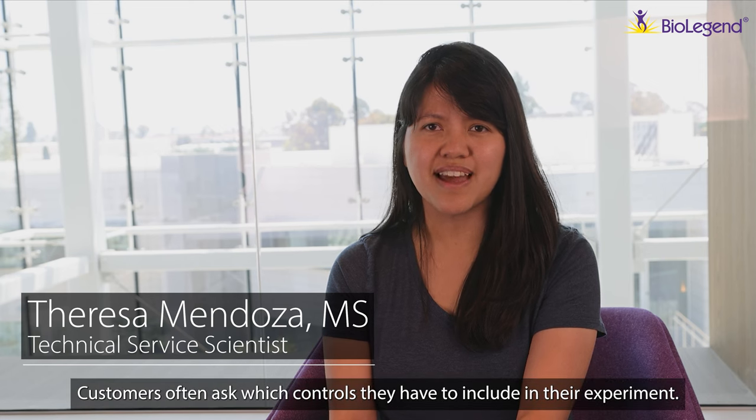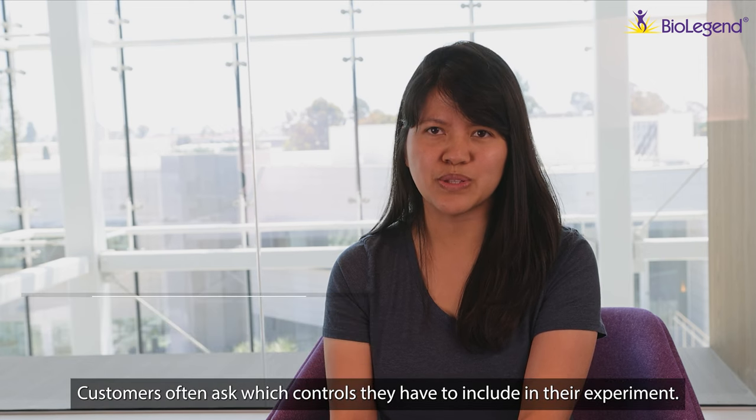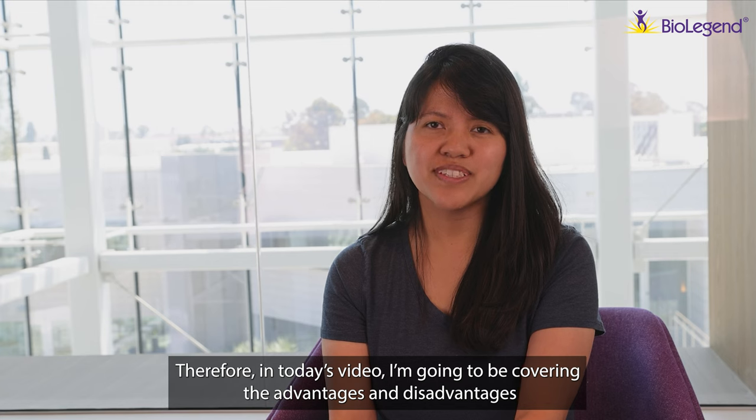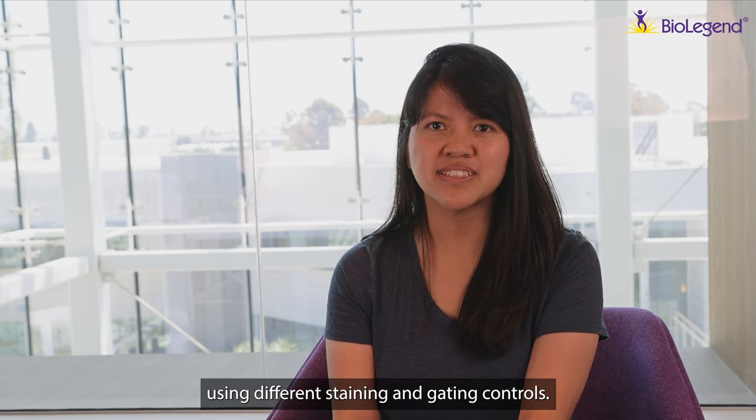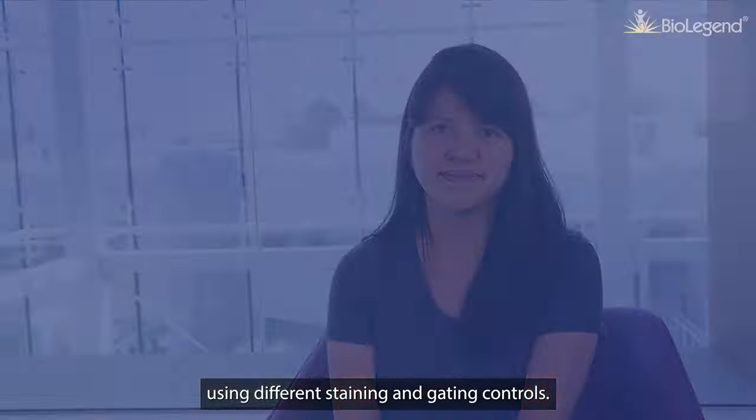My name is Theresa Mendoza, and I'm a technical service scientist at BioLegend. Customers often ask which controls they have to include in their experiment. Therefore, in today's video, I'm going to be covering the advantages and disadvantages of using different staining and gating controls.